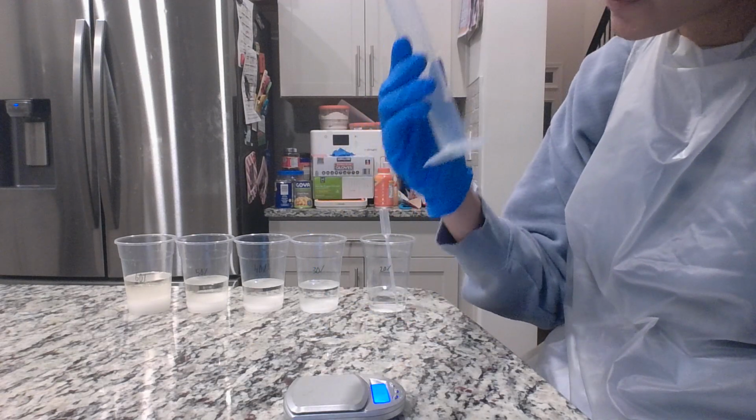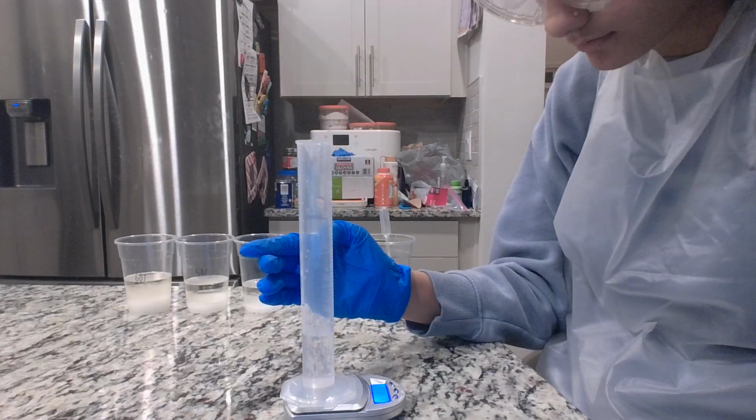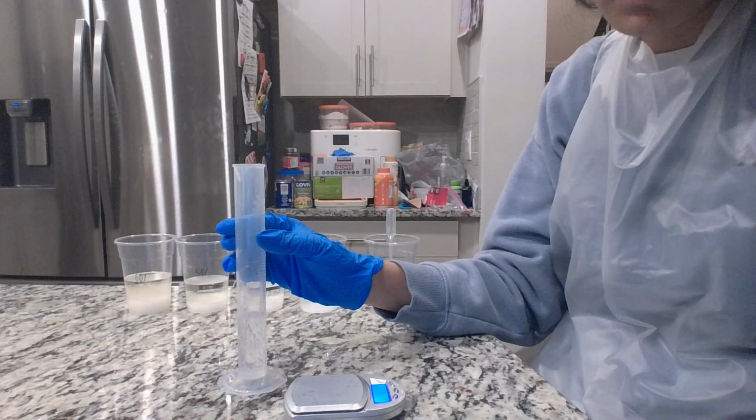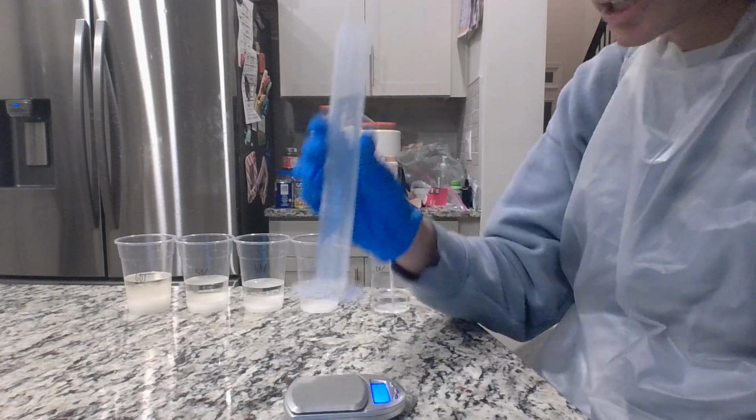This is 15 milliliters. This is 20 milliliters.